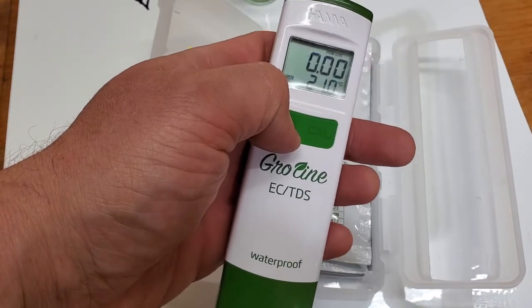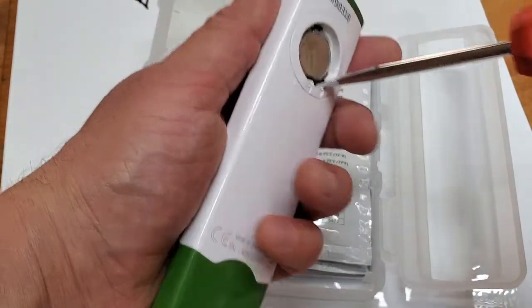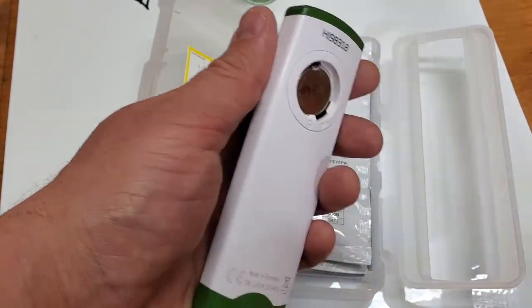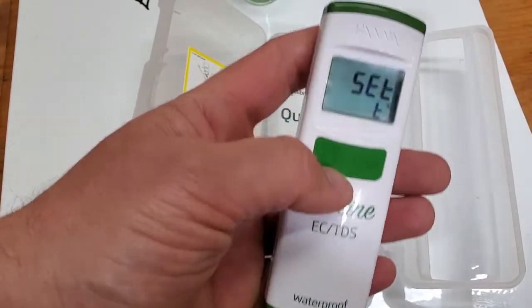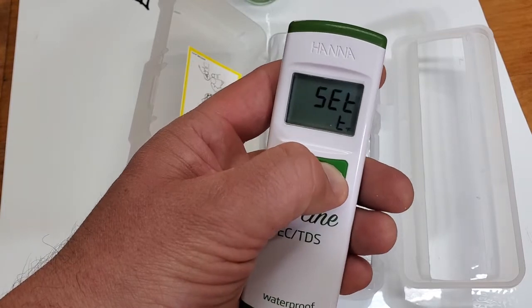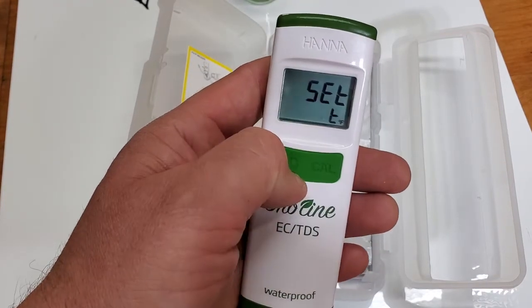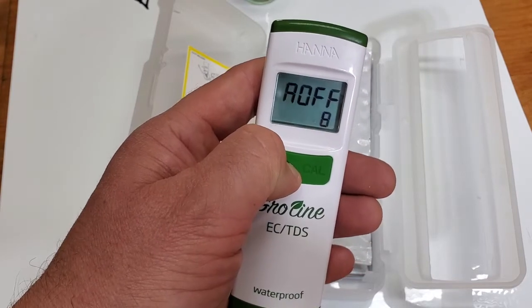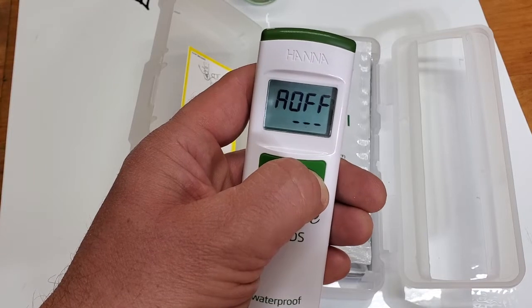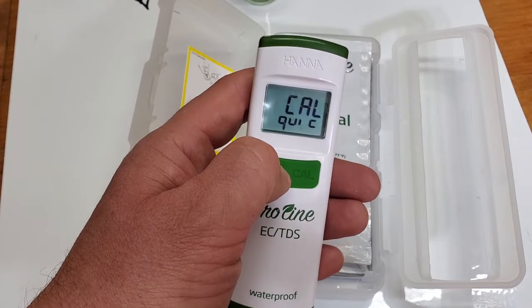It says battery 100% and it's not calibrated. To get into the menu, there's this little black button right here. Just click that with a pin and you can toggle if you want Celsius or Fahrenheit. Auto off is set for 8 minutes — you can do 60 minutes or none. We'll keep it at 8.